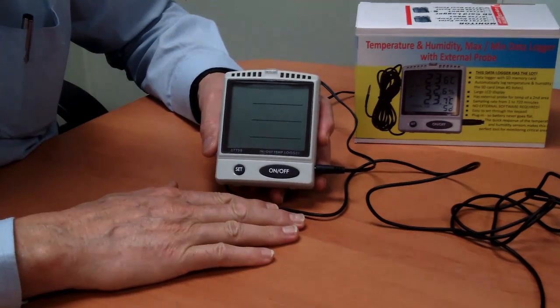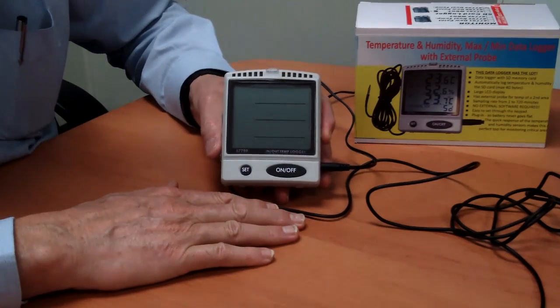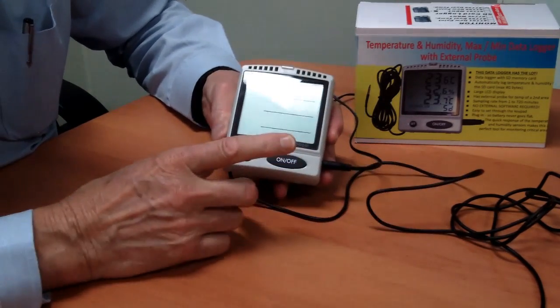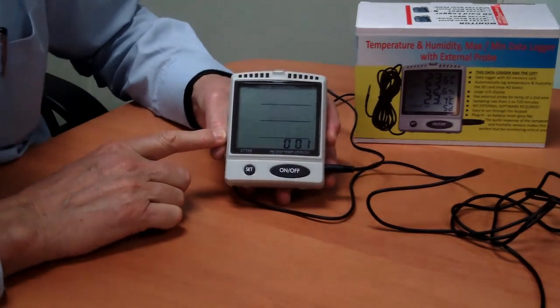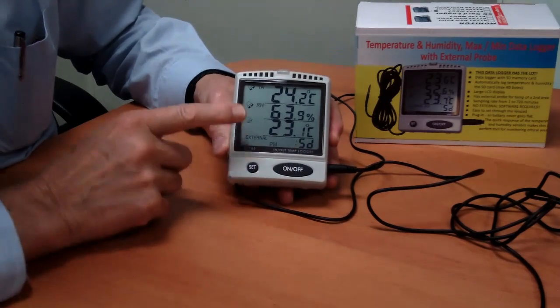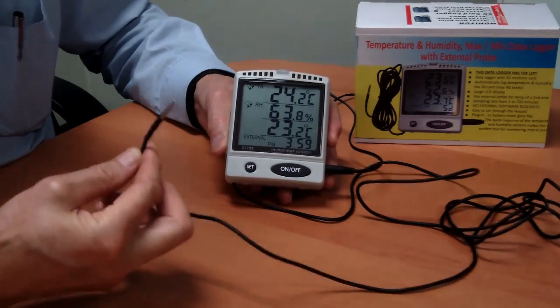Now this is the 87799 vaccine temperature monitor. This is designed to be used for fridges and meets and records the temperature for vaccine fridges. So this is the unit, we've installed the batteries, plugged it into power, we've installed the memory card, and now I'm just going to show you how to set it up. So you turn it on and it'll do a self-check and come up with 3 temperatures. So the bottom temperature is the temperature that we're interested in. It's the only temperature that we're interested in. And that's the temperature on this probe.